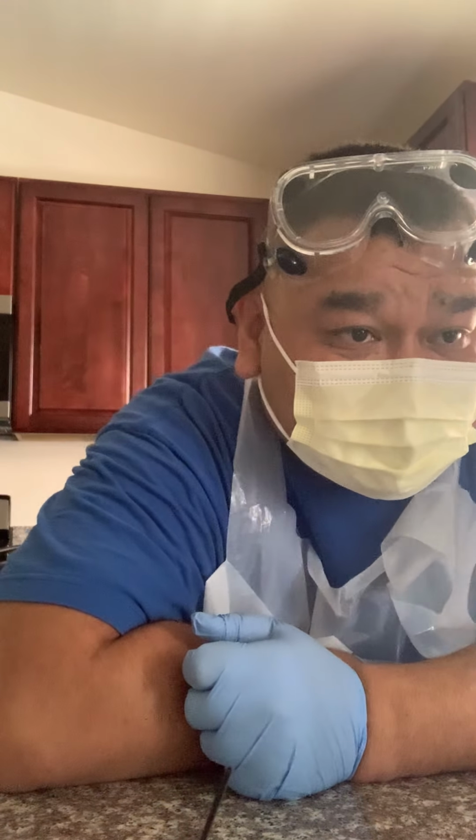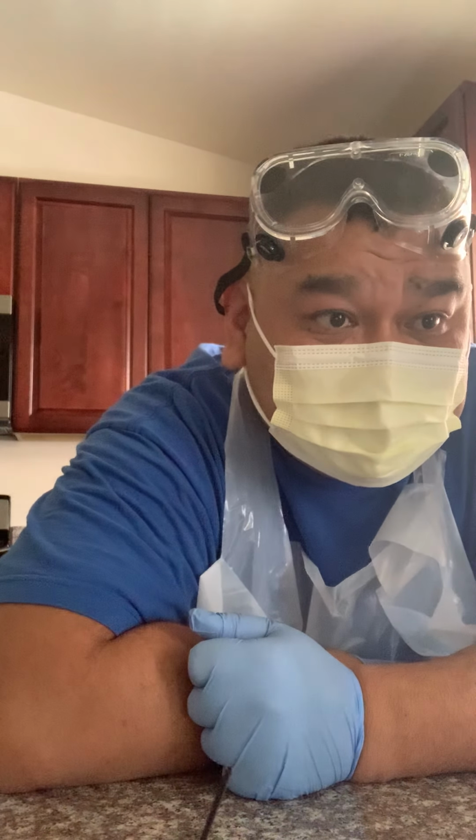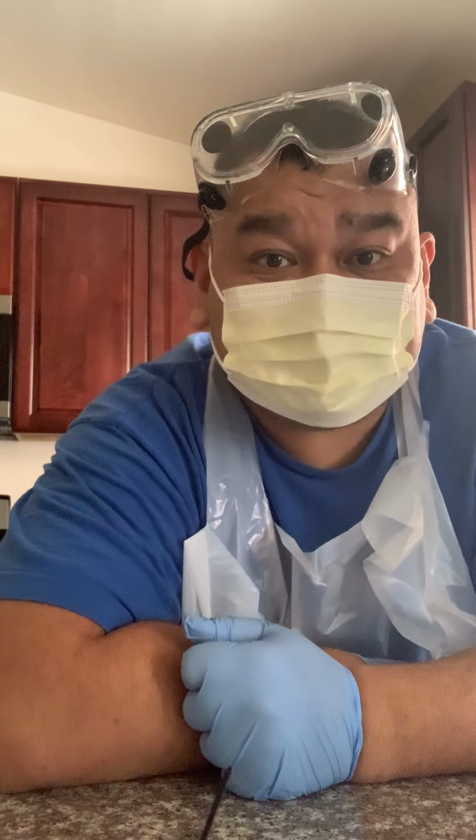Then it says remove the pipette from the bleach, wrap and dispose of the garbage, and clean your workspace. So I guess I've got to let it incubate for 48 hours. This is going to be the video for the first one, and I'll do a video for the second experiment.